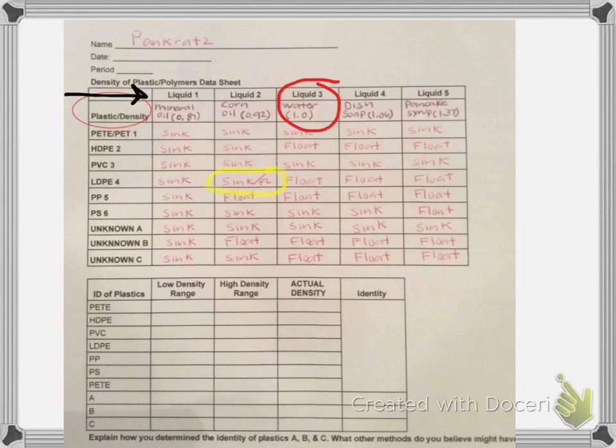For polypropylene, I see that I had 1 sink and 4 floats. Polystyrene, I had 4 sinks and 1 float. And right away, you can already start seeing that there's a trend going on with our unknowns. Our unknown A were all sinks. So using my deductive reasoning, as in forensic science, I can say right away that unknown A has to be either PET, because that one had all sinks, or possibly PVC, which also had all sinks. So right off the bat, I'm going to be able to limit which of those 6 plastics unknown A is.